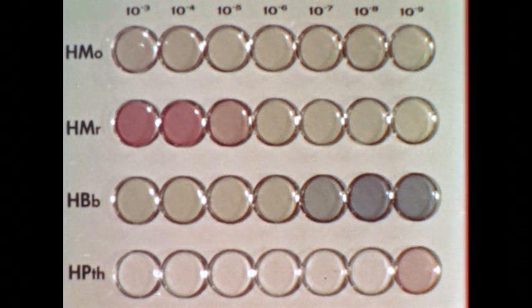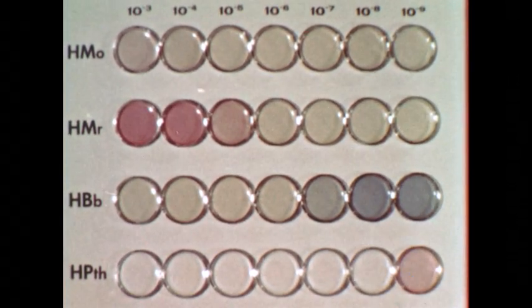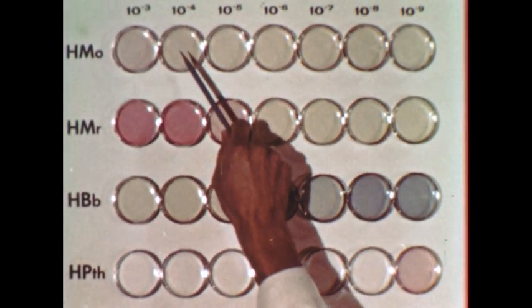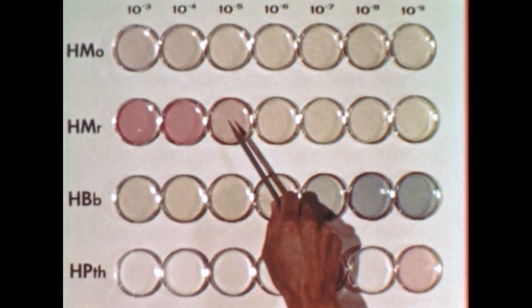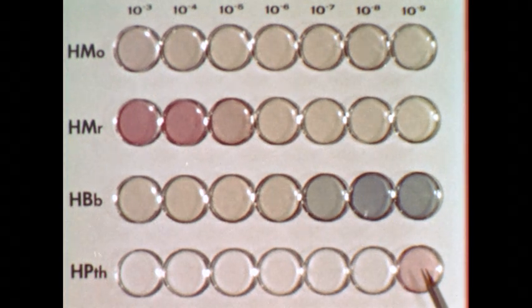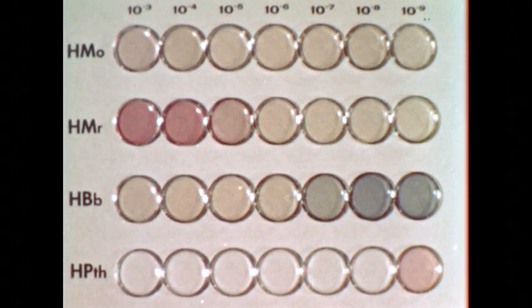Each indicator donates protons and changes color at a different acidity. Methyl orange donates protons appreciably at 10 to the minus 4, methyl red at 10 to the minus 5, bromothymol blue at 10 to the minus 7, and phenolphthalein at 10 to the minus 9. Each is a weaker acid than the ones above it.